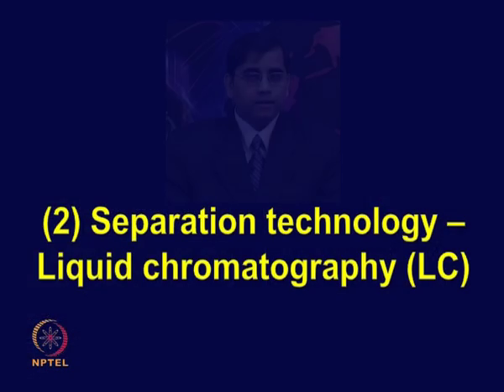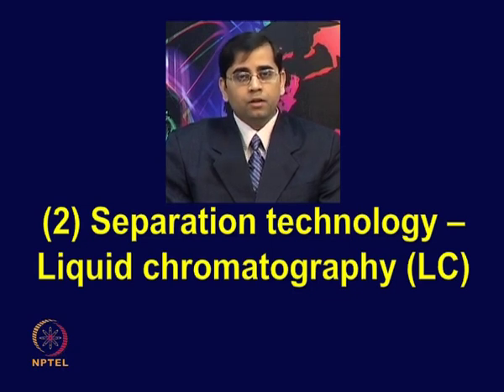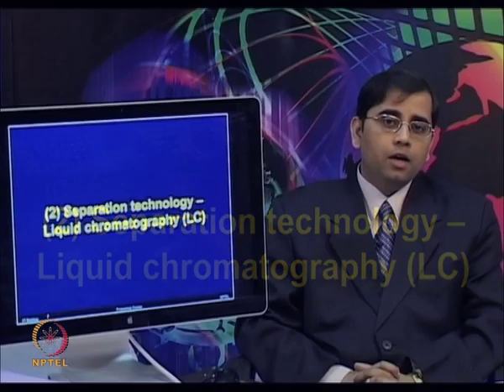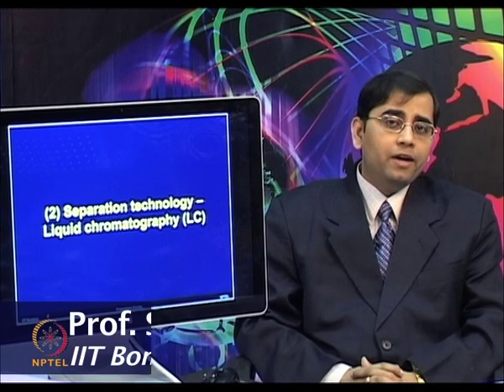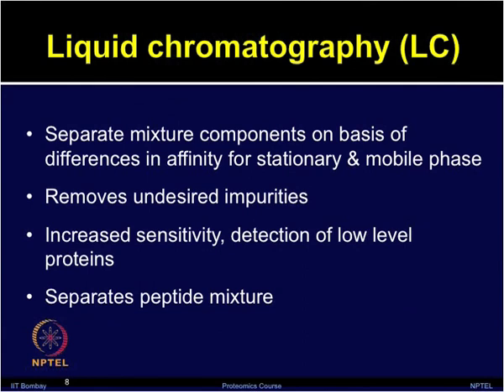So, after doing the in-gel digestion, now let us move on to the second part, the separation technology, liquid chromatography or LC. Chromatography in general is a physical separation method in which components for separation are selectively distributed in two immiscible phases, a mobile phase flowing through the stationary phase. Depending upon the mobile phase, the technique is termed as either liquid chromatography or gas chromatography, etc. So, what is liquid chromatography?